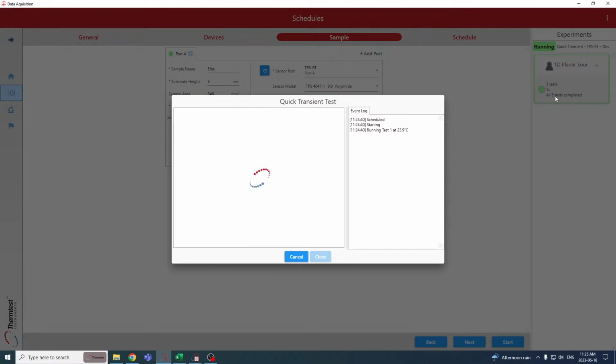So right now, if you were to see the front of the instrument, you would see on the display screen it say balancing the bridge. It has an internal Wheatstone bridge, which is according to the ISO. And once it's done balancing the bridge, it'll go into the 5-second measurement. What's happened is there's a current being supplied to the sensor, which generates heat. Due to the one-dimensional heat flow, that heat will travel symmetrically down the lengths of those materials. That measuring can be done asymmetric as well.